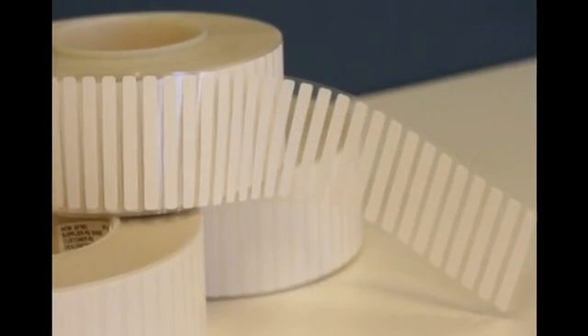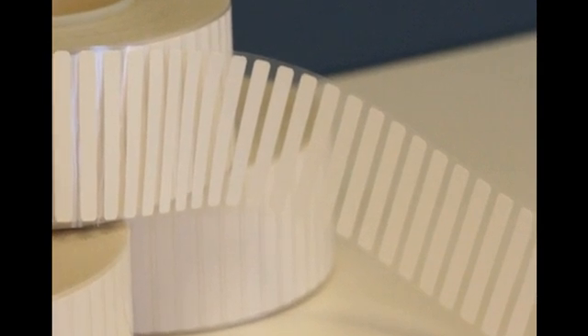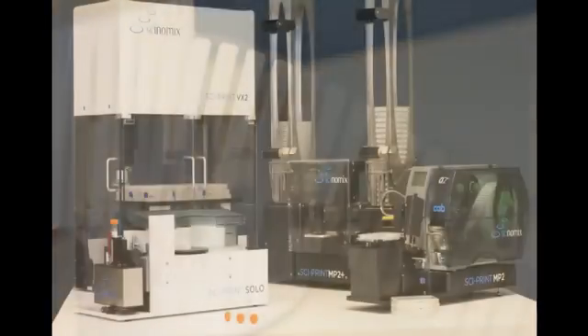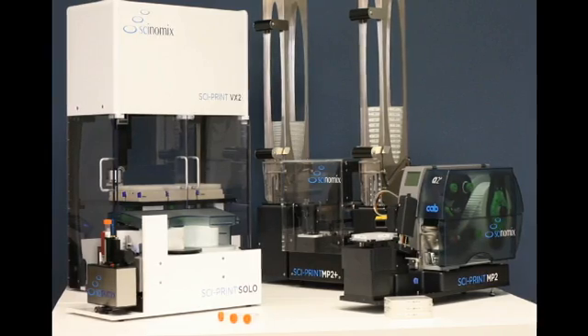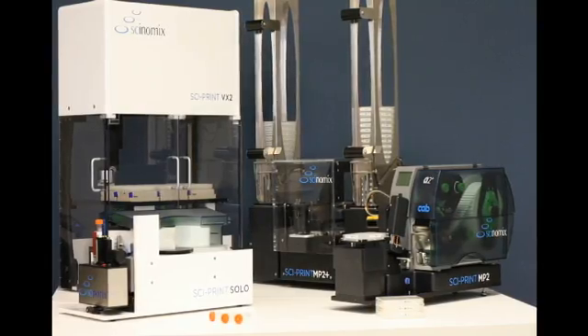Labels suitable for use in minus 80 degrees Celsius freezers that are compatible with Synomics's plate labelers are available and are normally stocked for quick delivery. The Synomics line of labeling systems for vials, tubes, and plates can increase your efficiency, allowing you to concentrate on more important tasks in the lab.